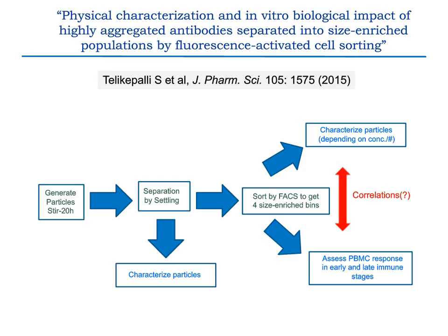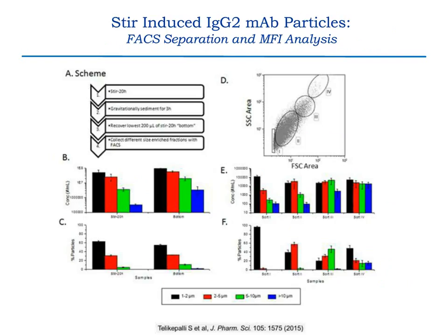Now, I'm not going to go over any of the biological data. I just wanted to give you a brief overview of our ability to characterize these particles by FACS. This is a schematic that shows that we stirred the particles, we sedimented them, we collected the bottom, and then we separated them by FACS.